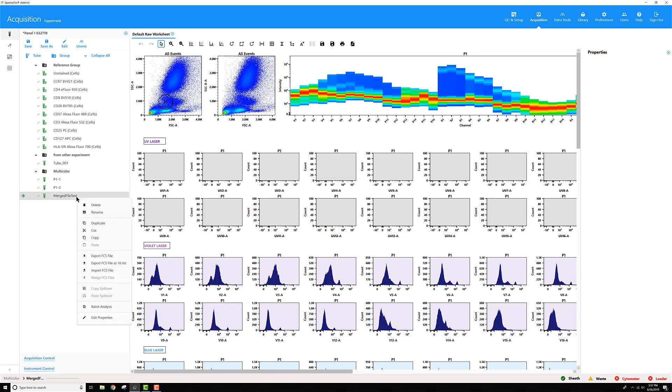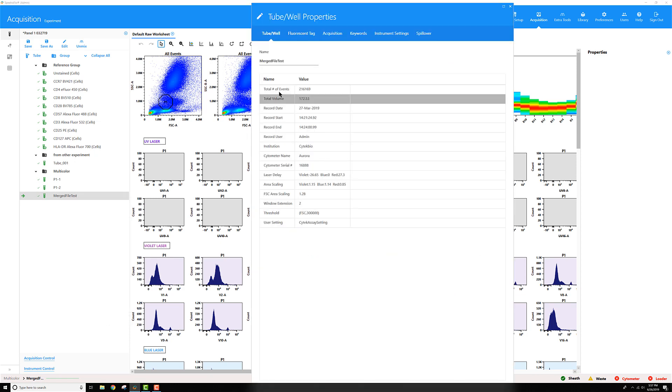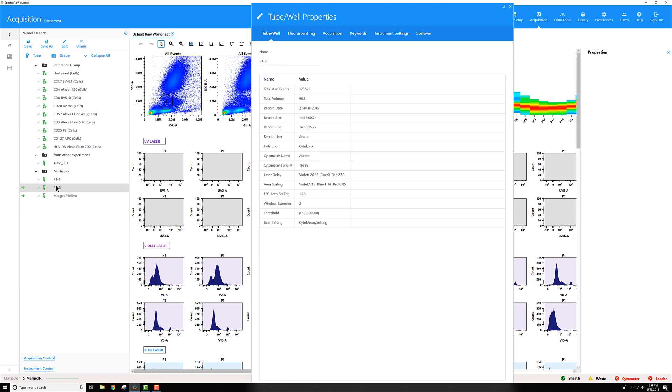If I right-click on the tube and go to Edit Properties, I can compare the events in the file against the events from the other two files.